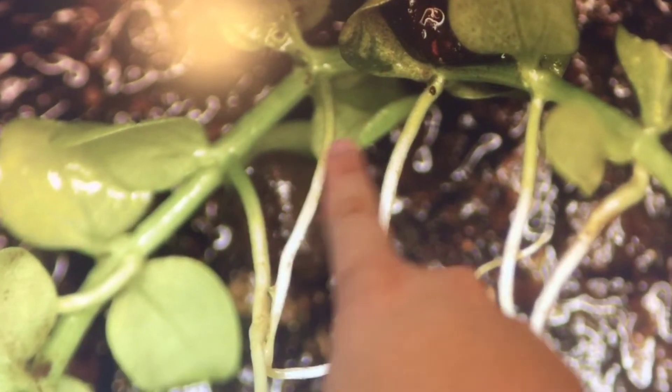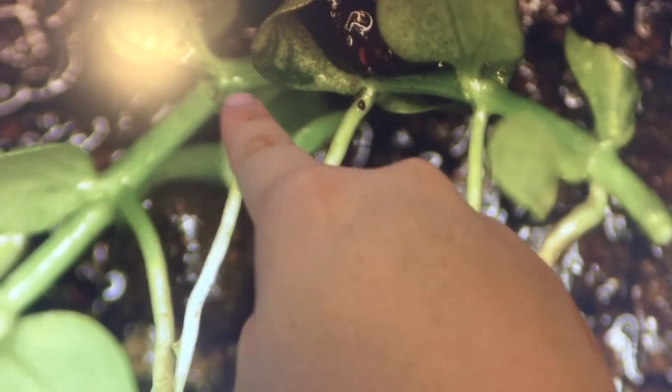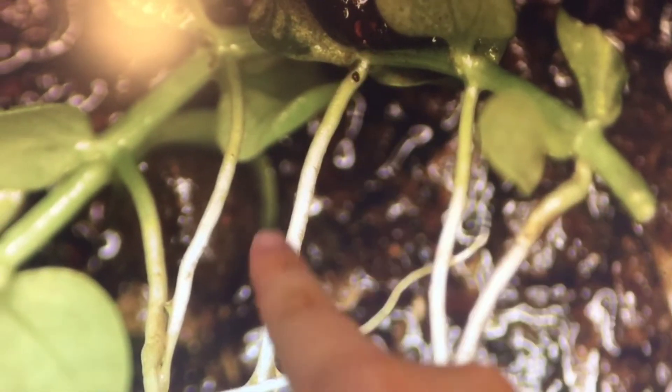As you can see, this is one piece of Monte Carlo I cut off, and the white roots come down — one, two, three, four — from each node. If you can see, that's where the roots grow from. From each node, there are roots coming down.